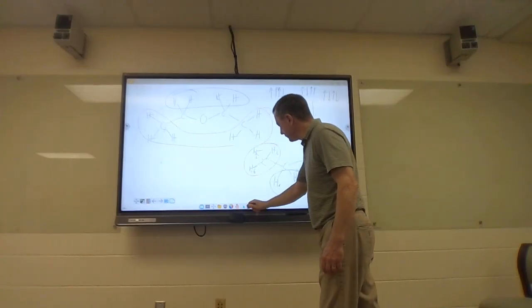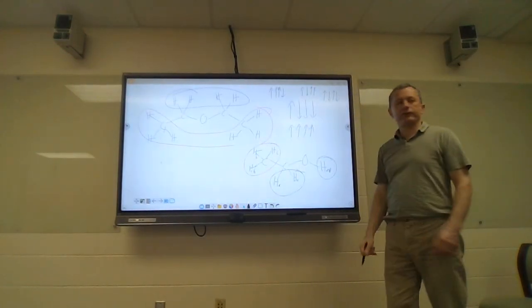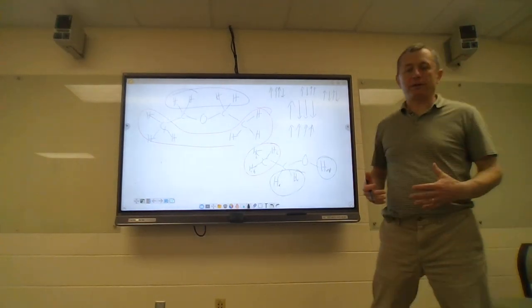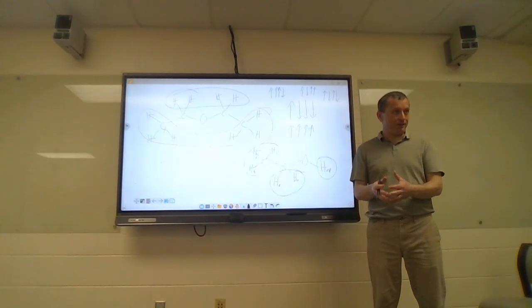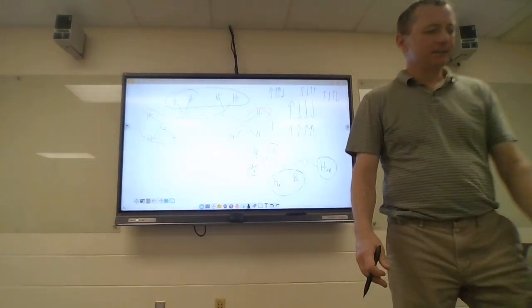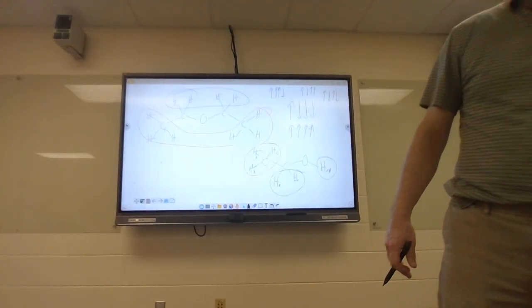That's a different set. And that's all by itself. So one trick here is being able to identify all the hydrogens that are the same and all the hydrogens that are different. With that, let's try to switch to number 4.